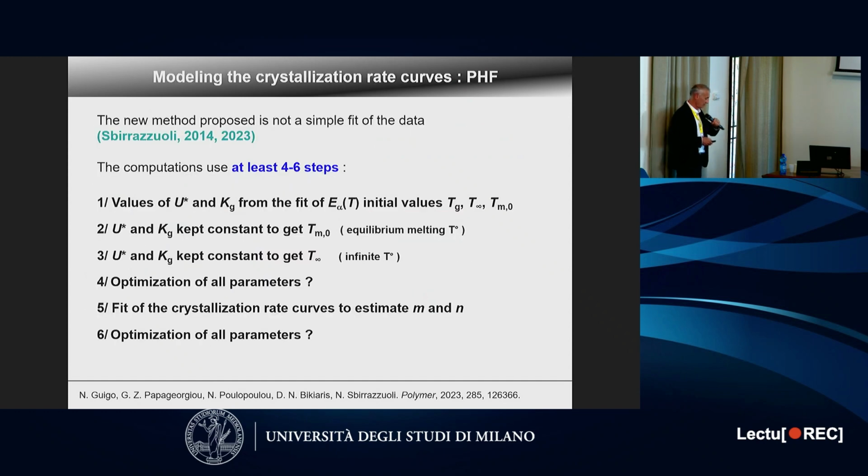So I don't want to go into detail with the explanation of the computation, but I just want to say that it is not just a simple fit of the data. There are many methods where you just fit the curve with this very complex equation and you get these parameters. The problem is that in that case, parameters will not have a meaning. So what I am doing is much more difficult, takes more time. I start by fitting the activation energy dependency.